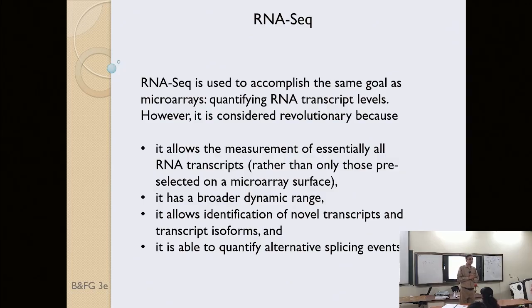You collect all RNA transcript data and quantify the abundance of RNA transcripts. Some transcripts could be arising from genes that are not known, so you may identify new genes. That is the gene discovery we discussed. So gene discovery through RNA-seq, or you can find novel isoforms.